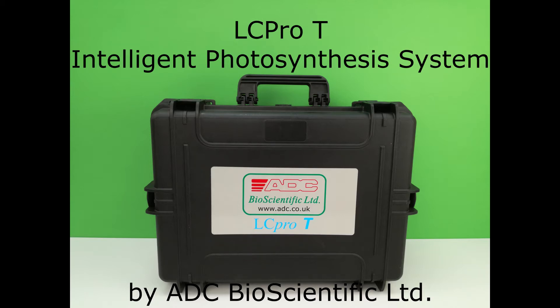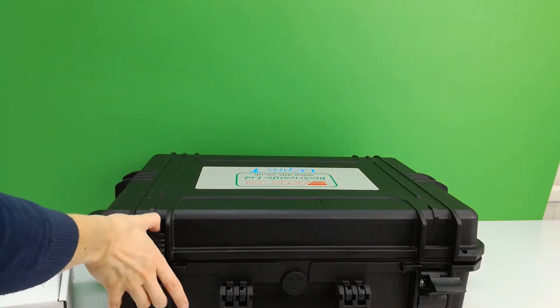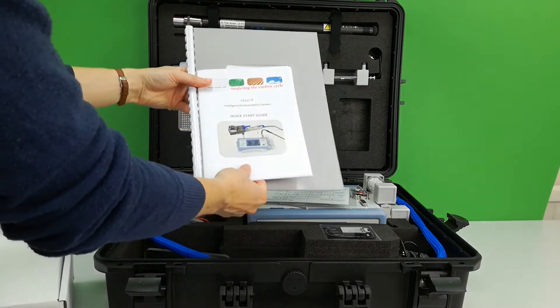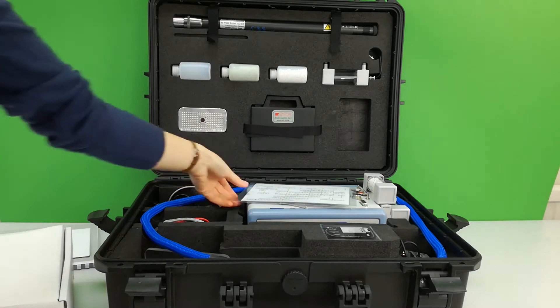Welcome to the LC-PRO-T Intelligent Photosynthesis System by ADC Bioscientific. When you receive your system, open the carry case and you will find a full manual and quick start guide, as well as a helpful quick reference software menu guide.